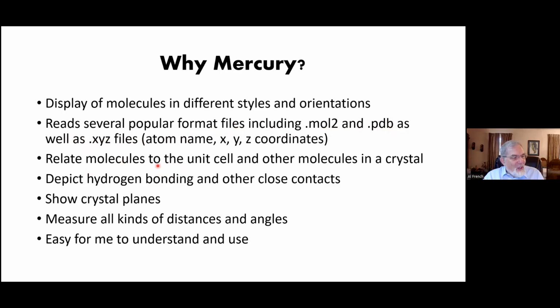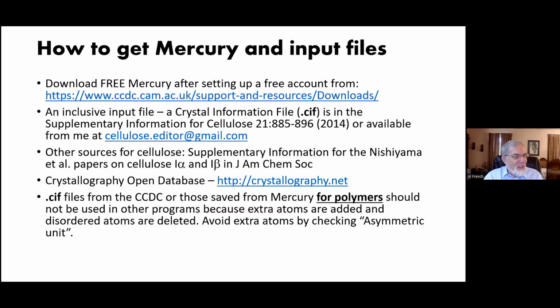It can relate the molecules to the unit cell and other molecules in a crystal, and I'll show you this, depict the hydrogen bonding or other close contacts, show the planes in the crystal, and measure all kinds of distances and angles within the molecular structure. And it's easy for me to understand and use. So I hope that you can have the same experience with it.